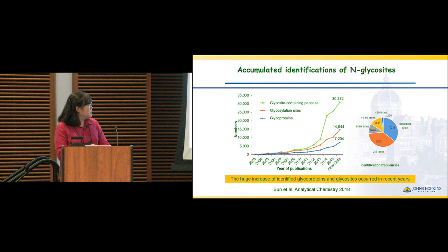Through this, we can also investigate the proteins commonly expressed in multiple tissues or cells, and they're overlapping with a body fluid, for example, serum or urine sample, to determine what are the specific proteins that can be detected and can be used to detect certain tissue-specific changes.